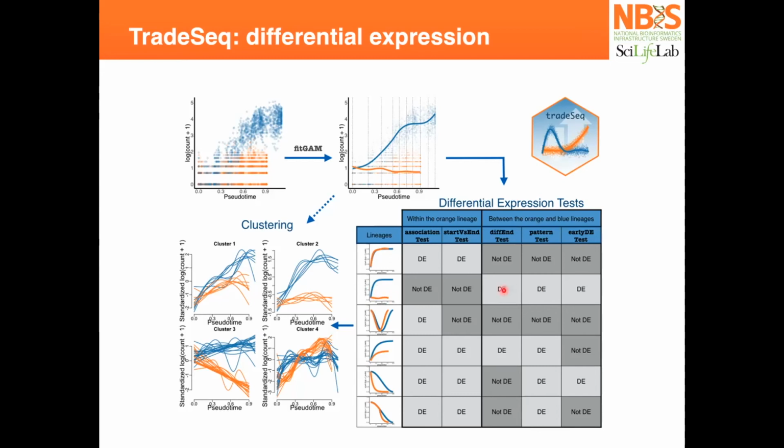And in the tutorials, you will see more about those differential tests and how to run each one of them. But just keep in mind that it is a little bit more complicated than normal differential gene expression, and really depends on your biological question or on the curves that you find in your data.